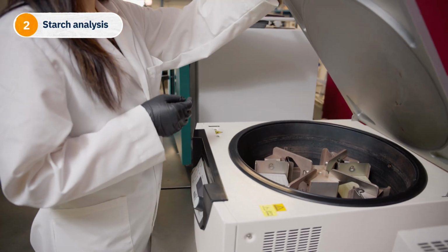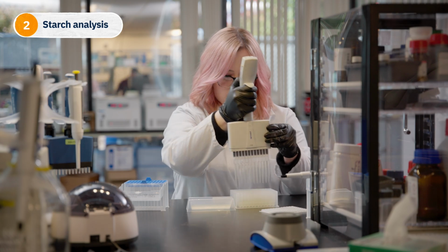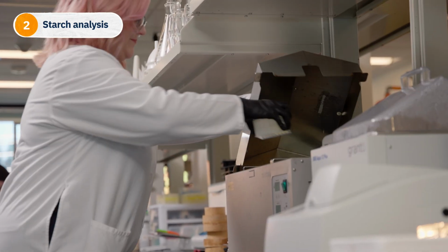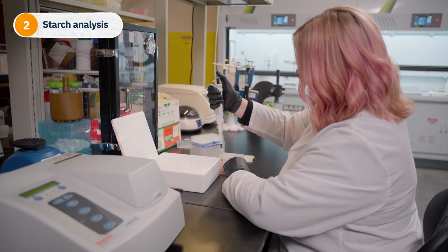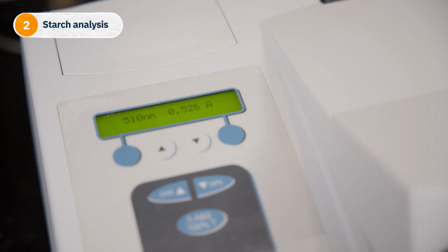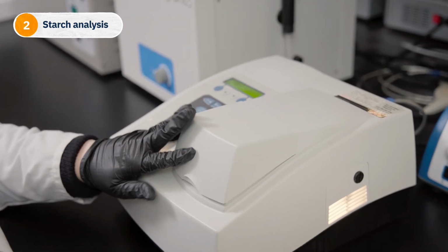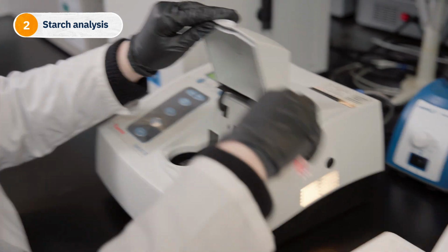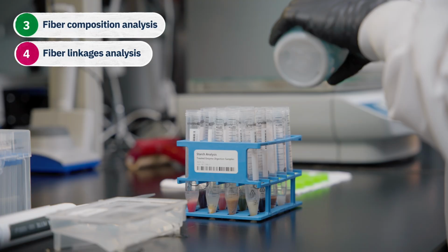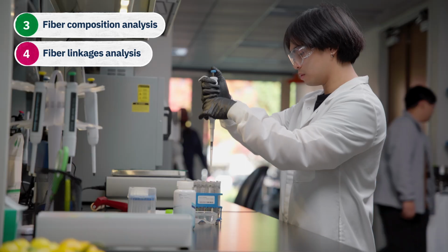The ethanol-soluble fraction containing the digested starch is dried and labeled with a reagent that enables glucose to be analyzed on a spectrophotometer. The glucose-derived starch absorbance is measured and compared to a standard for quantitation. The ethanol precipitated fraction is then solubilized and homogenized before being separated for two different workflows.